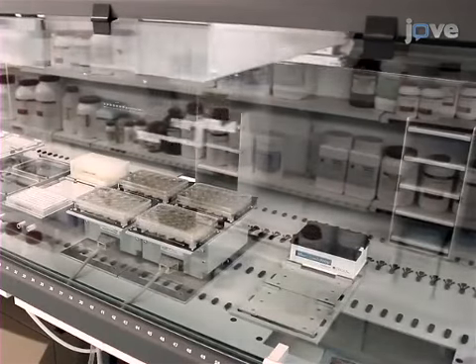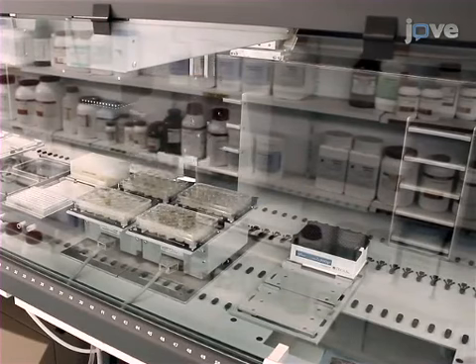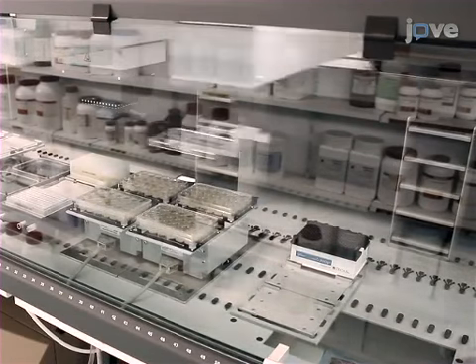After transformation of the bacteria, begin by using the robotic gripper to set aside the lid of the first 24-well LB agar plate.